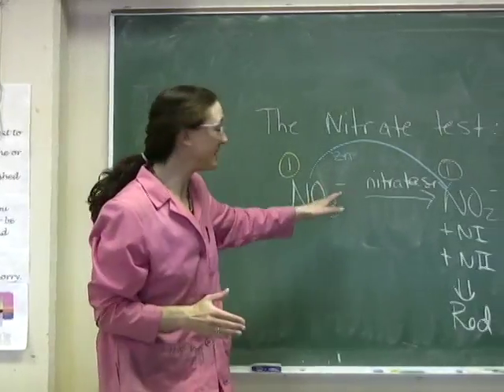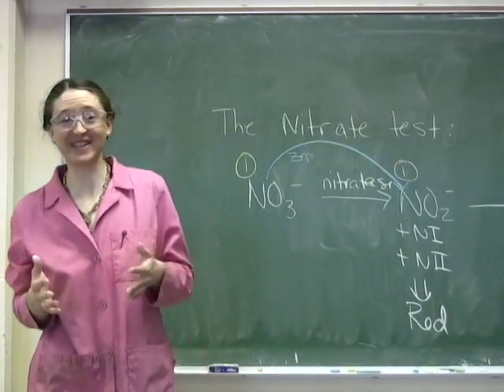Cool. So that helps me understand the nitrate test. I hope it helps you guys too. Oh, let's check our two. Hey, yay, pink after zinc.